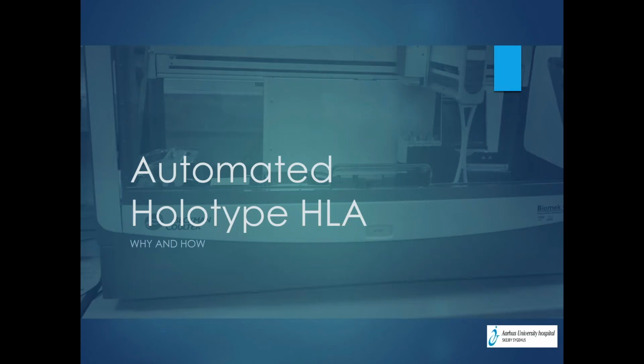So tracing samples when you're doing manual pipetting is in the technician's head. So it's really important that the technician is sitting in a nice environment and that there are no distractions, in my opinion, because you're handling all those samples at a time.